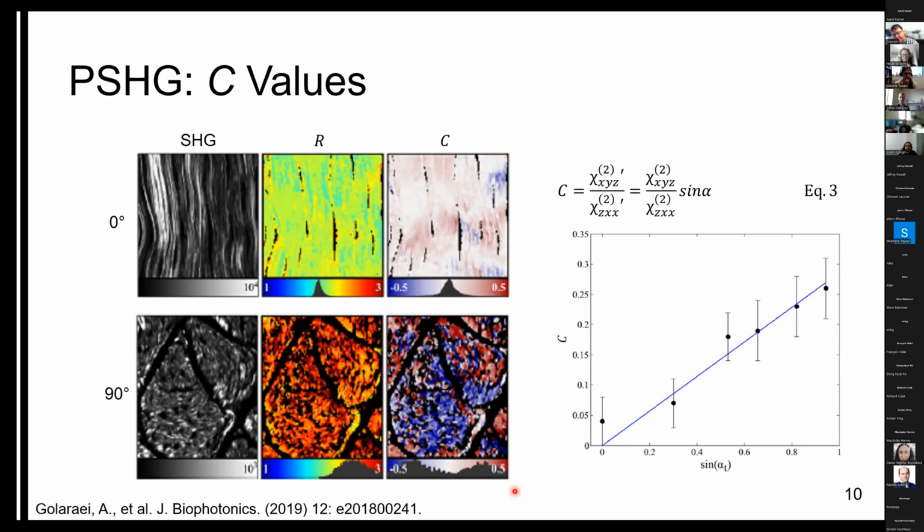This makes me remember when we do phase measurements in the plane, we see domains that are pointing left and domains that are pointing right. So does blue mean pointing down and red pointing up? Yes, exactly. That's exactly what they indicate. Oh, I was just gonna say, I know when they flip it, they see the reverse.